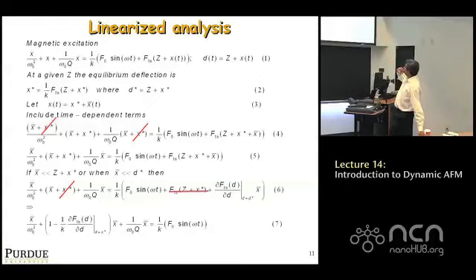Okay? So basically all I'm doing is replacing the FTS term by its mean value and by its slope. So I'm just saying that, look, it's a nonlinear function, but locally let's call it simply a number plus a slope. So locally I'm just doing a linear approximation of it as a straight line. That's what I've done basically. Okay? So what I've found is we come to equation 7, and equation 7 is really, really interesting.